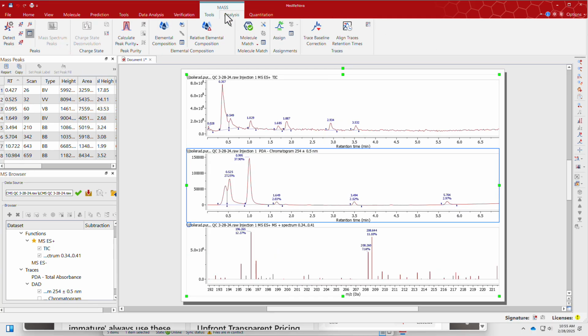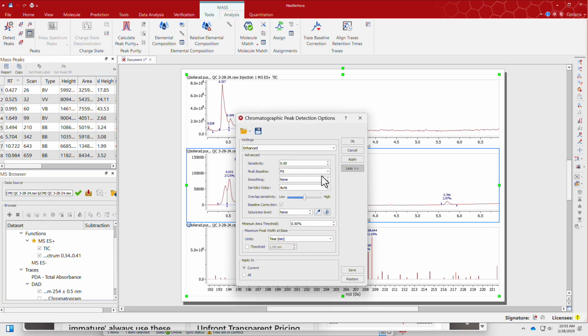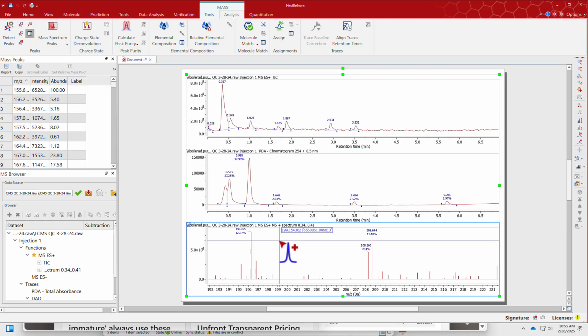You can add or delete peaks under the Analysis tab. Different modes are available: manually add or delete peaks, clear all, and detect automatically. You can also edit the peak detection parameters with peak options. You can also generate a peak list for both chromatograms and spectra by choosing Show Peak Table while the desired spectrum is selected.